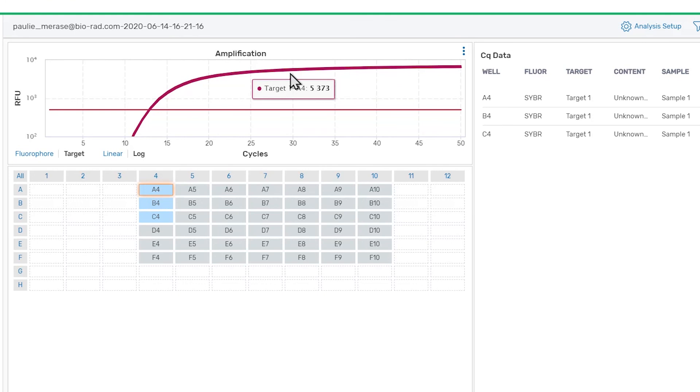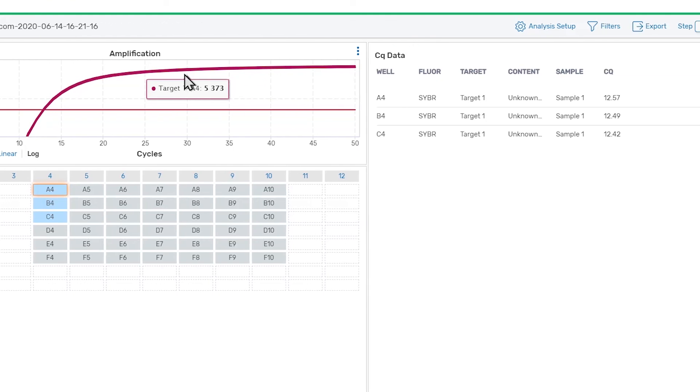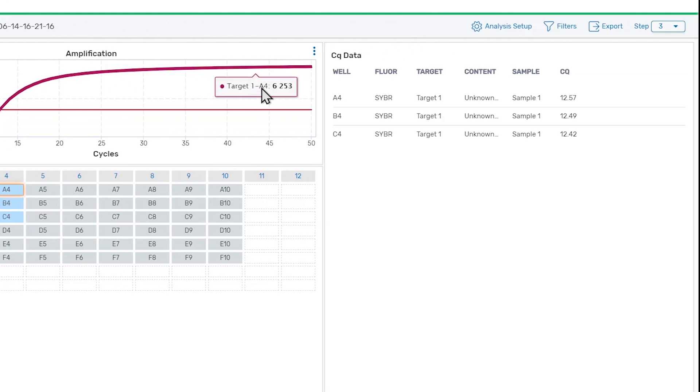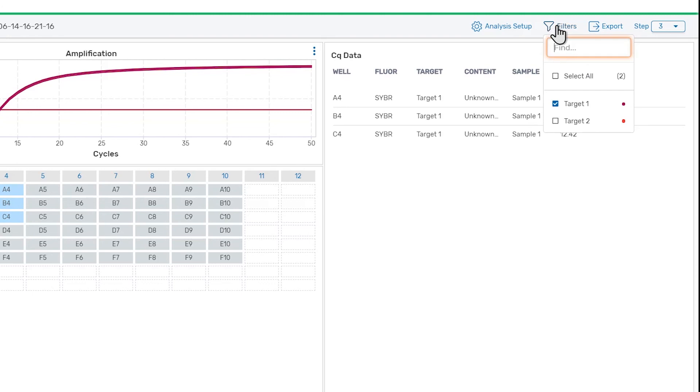If you want to review data for a single target at a time, you can use the Filters menu to focus on specific targets. This may also be useful when reviewing data for multiplexed reactions.